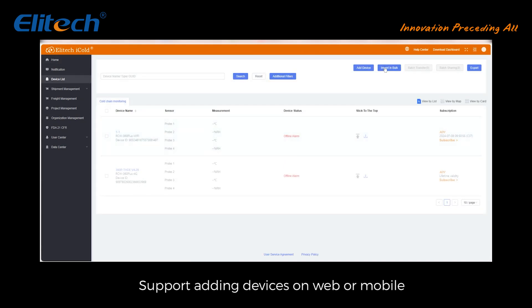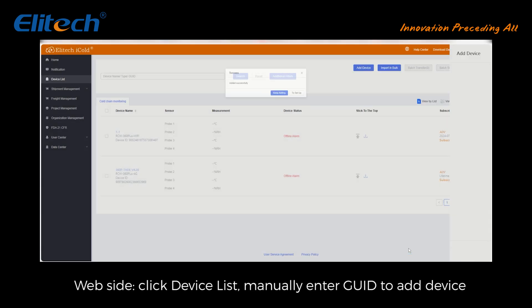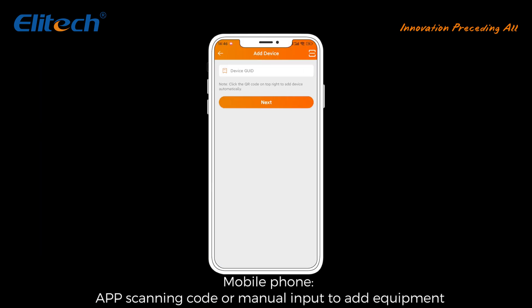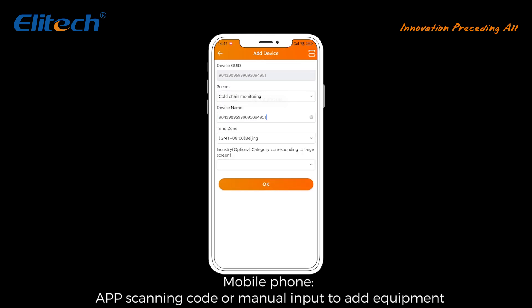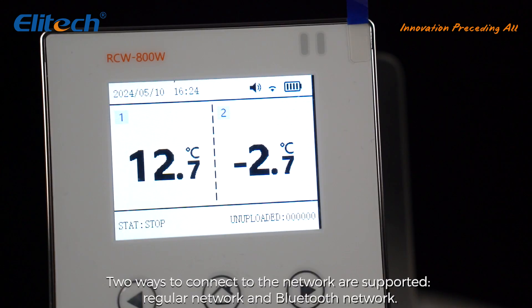Add device: supports adding devices on the web or mobile website. Click device list and manually enter the code to add a device. Mobile phone app supports scanning code or manual input to add equipment. Two ways to connect to the network are supported: regular network and Bluetooth network.